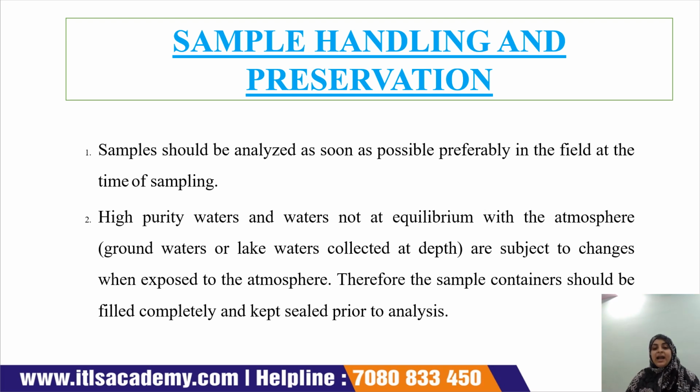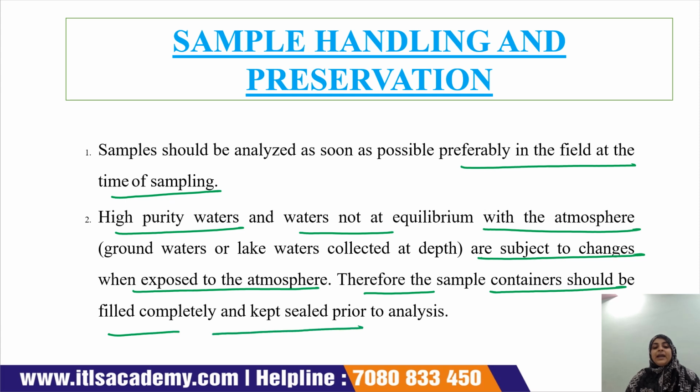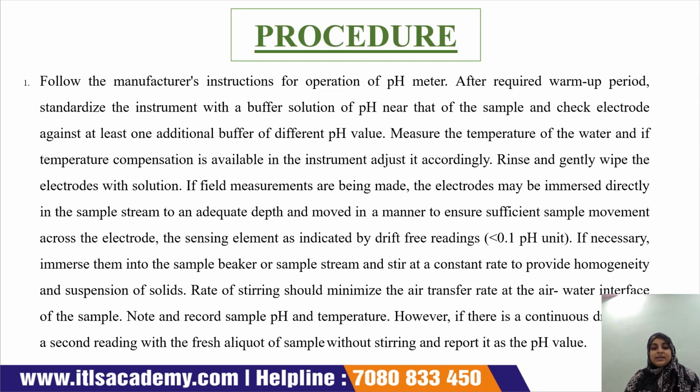Now sample handling and preservation. The sample should be analyzed as soon as possible, preferably in the field at the time of sampling. High purity water and water not at equilibrium with the atmosphere are subject to changes when exposed to the atmosphere. Therefore, the sample container should be filled completely and kept sealed prior to the analysis.